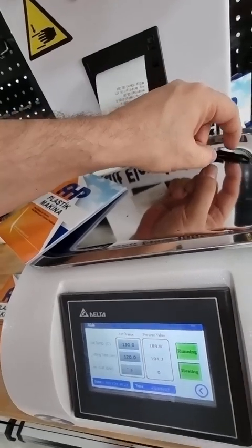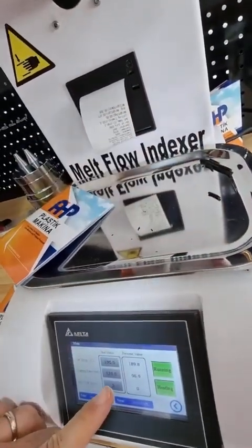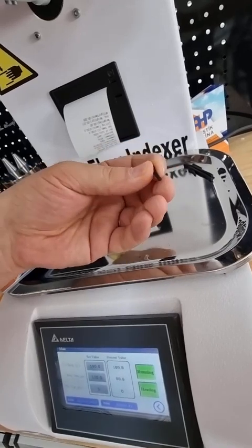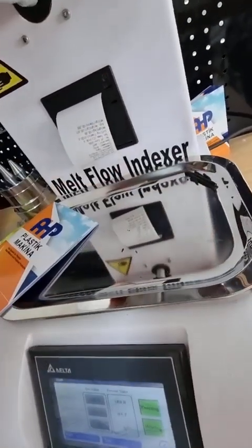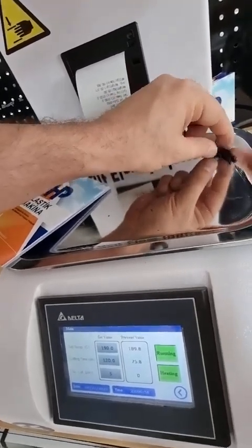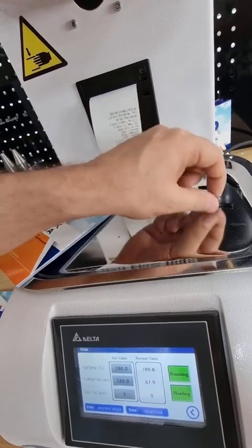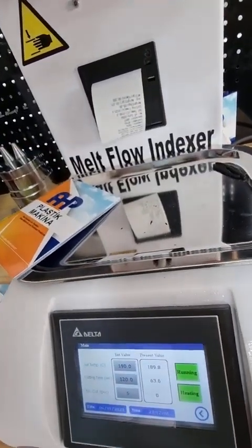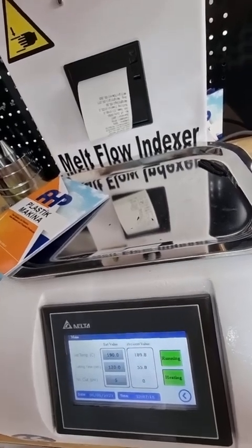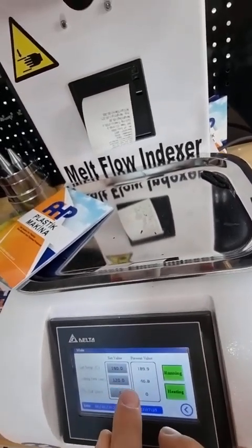If you don't know anything about the melt flow rate of the material you're testing, set the time so the sample cutout length is around 20–30 mm. According to the norm, if you cannot define the cutting time at the beginning, start with a time that gives sample lengths of 15–30 mm. After measuring the melt flow rate in the first test, you can determine the correct cutout time from the standard.